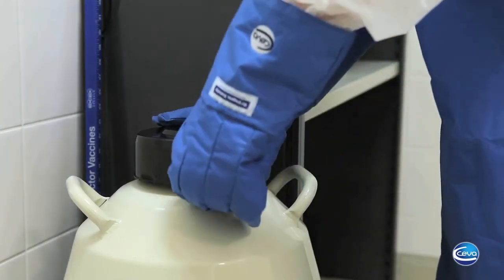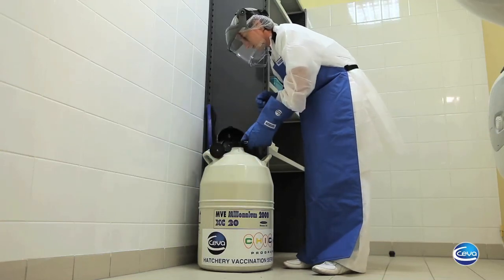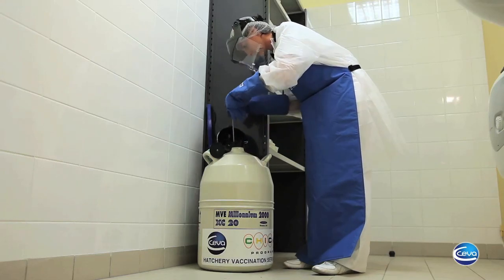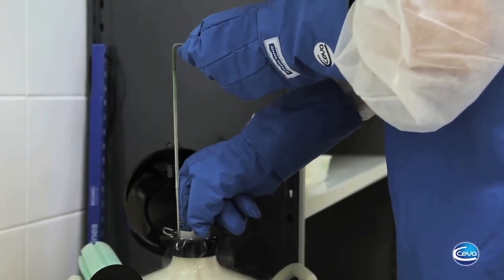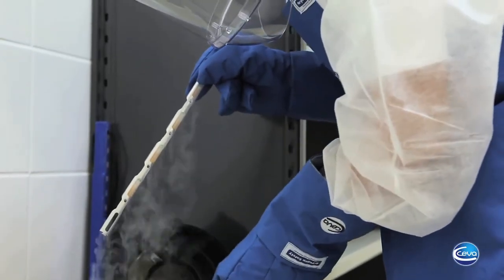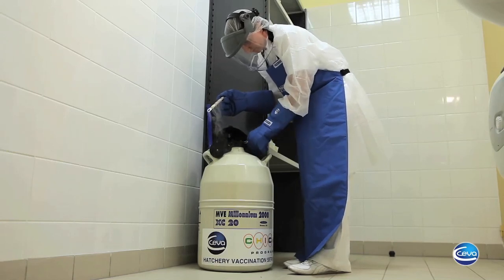Remember that it should take no longer than 1.5 minutes to complete the total operation, so you need to act very promptly to remove the ampule from the liquid nitrogen cylinder, unfreeze it in the thaw bath and inject it into the diluent bag. Remove the cane with the ampule as little as possible from the liquid nitrogen tank to maintain the temperature of the other ampules. The liquid nitrogen tank should be located as close as possible to the vaccination room.